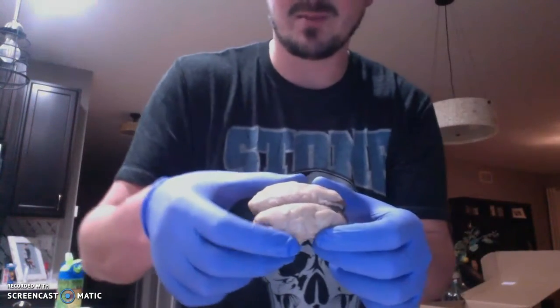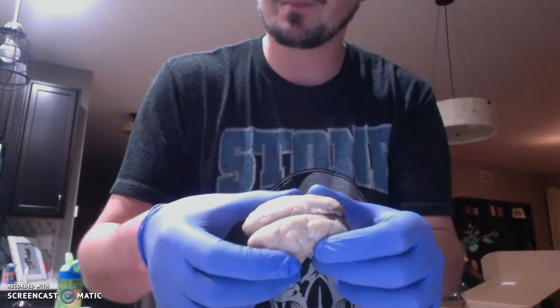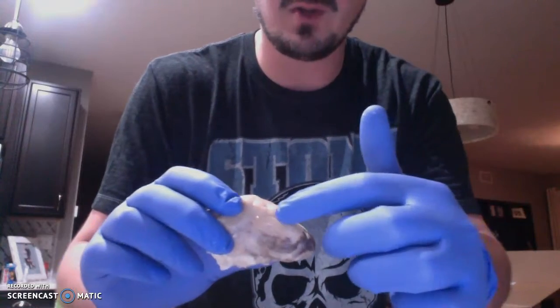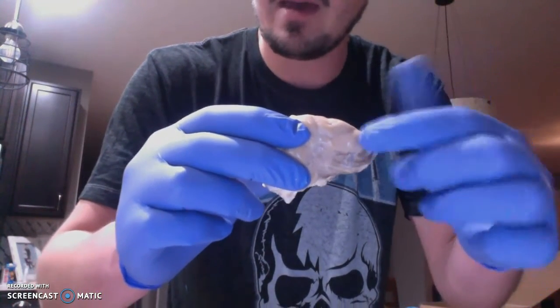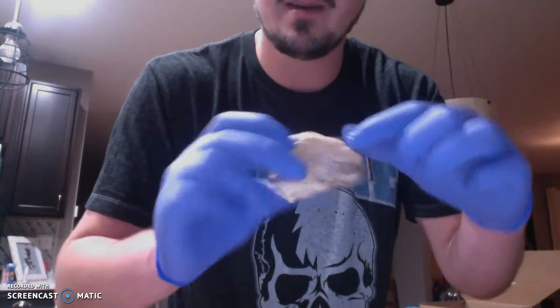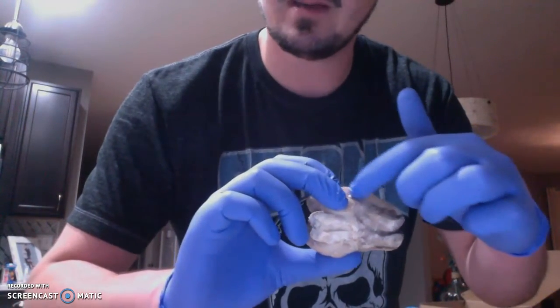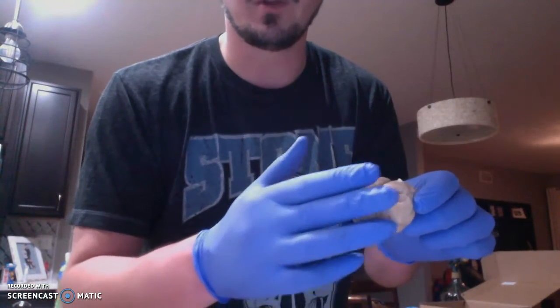Let's see if I can get my brain. So this is the sheep's brain, and we're going to talk about the different lobes here. There are actually 4 different lobes. The frontal lobe is in the front, obviously, this section. The parietal lobe is up here on each side. The temporal lobe is right here. The occipital lobe is in the back of the brain, the posterior, the occipital lobe.